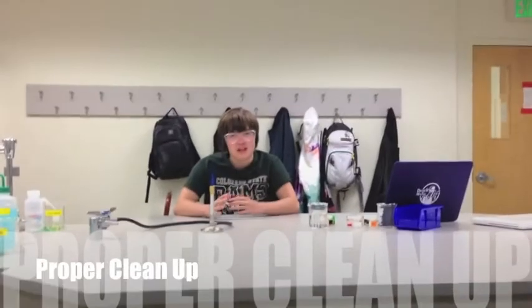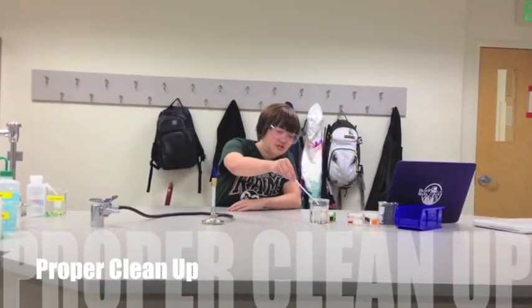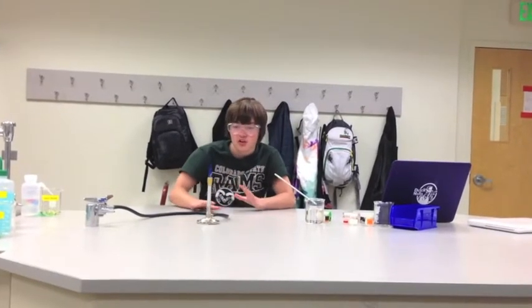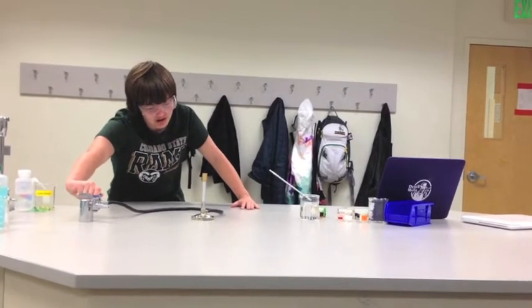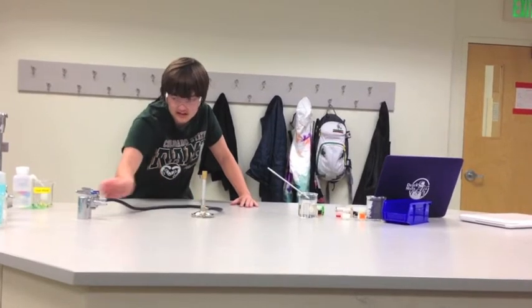Now you're done with the flame test, you should clean up. First thing you should do is put your hot wire in the beaker of distilled water while you clean up everything else. Next, you want to turn off the gas and make sure the flame goes out. Close the collar and detach the hose.